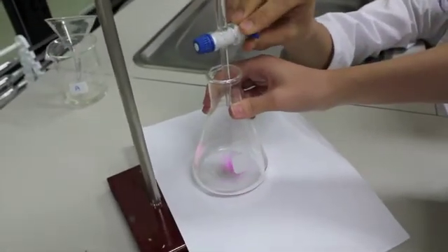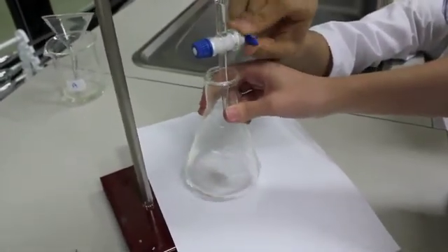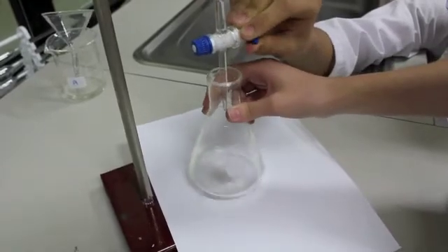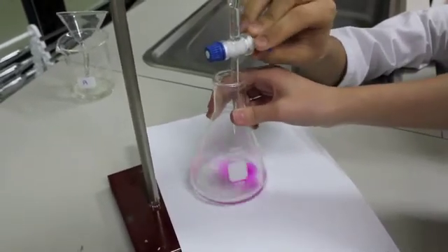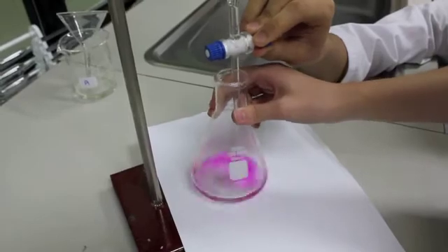Add the titrant in little by little into the flask or beaker. Remember to swirl after each addition. The point that the color changes permanently is your endpoint. Keep going until you reach that point.